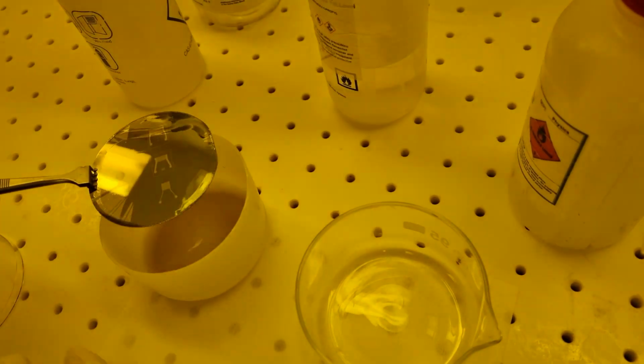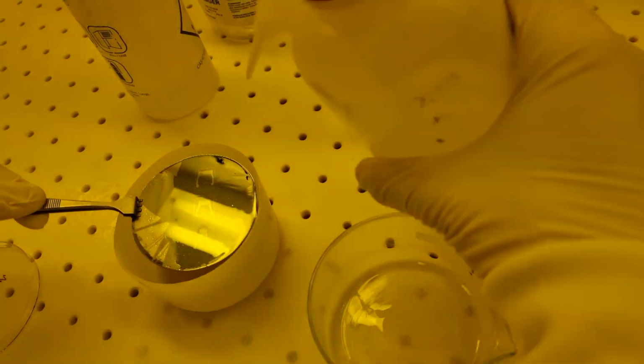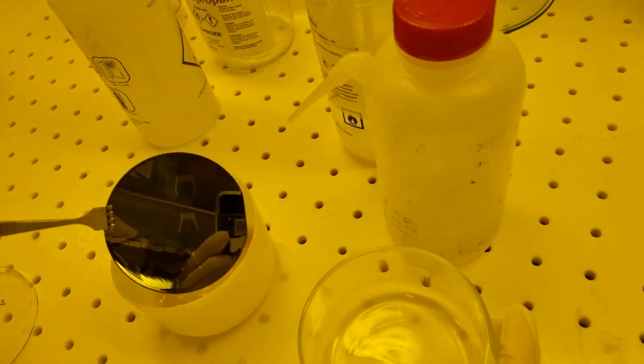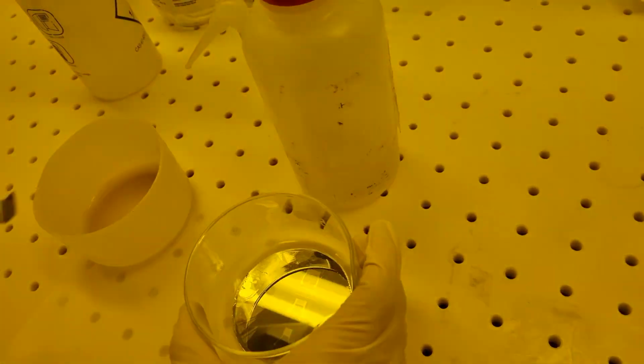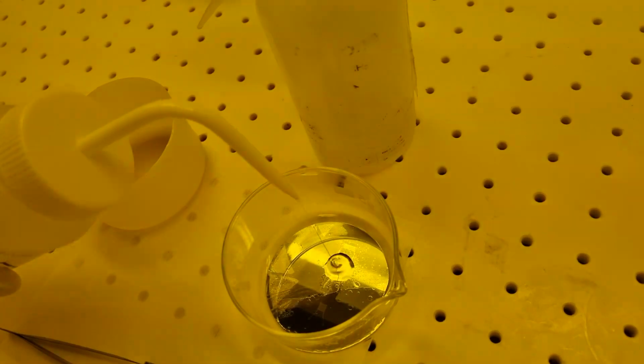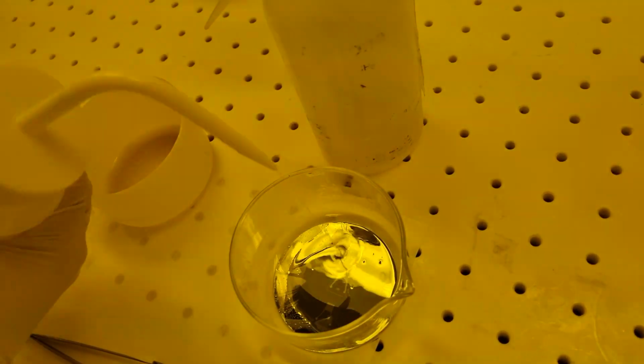Then move the wafer to a new dish while washing off bits of metal. The metal is not dissolved by the acetone and remains as flakes in the liquid that must be washed off from the wafer and the dishes. Getting all of the metal flakes off of the wafer and the dishes will require multiple washes.